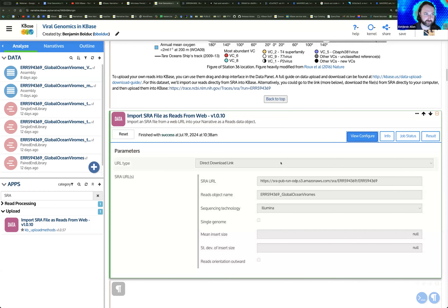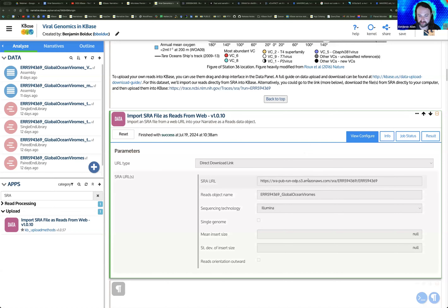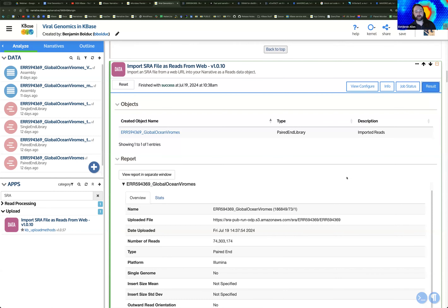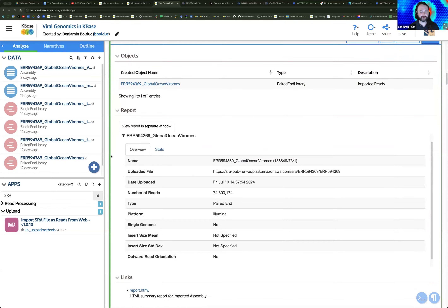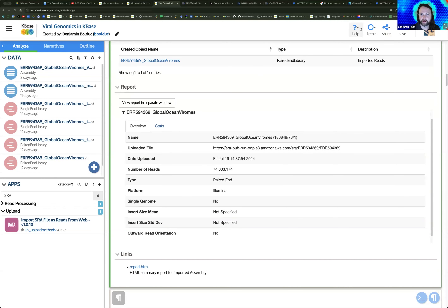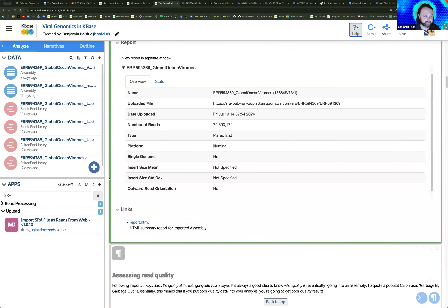Whether you're doing viral genomics or other metagenomic activities, this is a very nice way to pull data from other projects in. We start by pulling in this metagenomic sequencing data from Global Ocean Viromes, and it will give you a little report after the import job is successfully done. If you have any trouble importing, feel free to reach out to us on our KBase help board, which is linked in the resources document and accessible at the top of the narrative with the Help button.